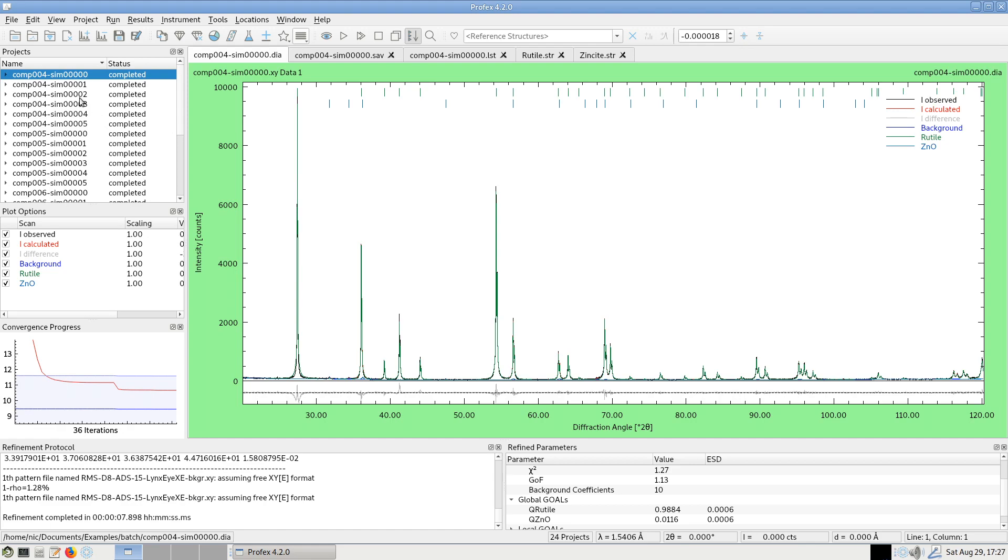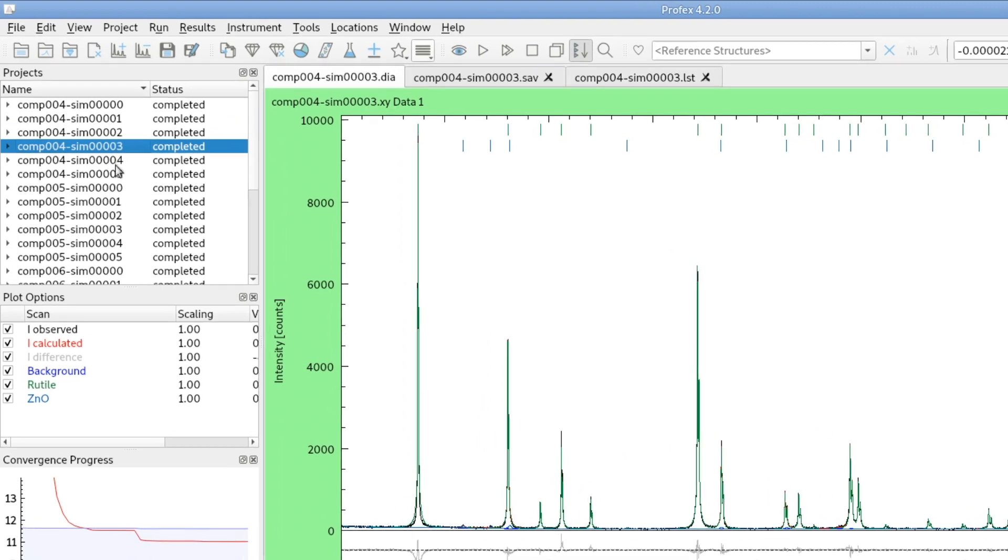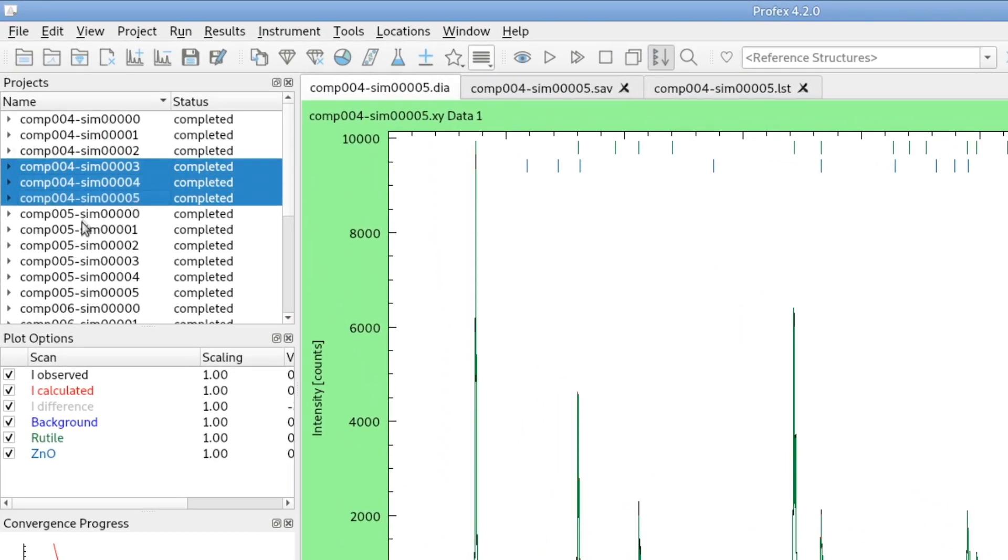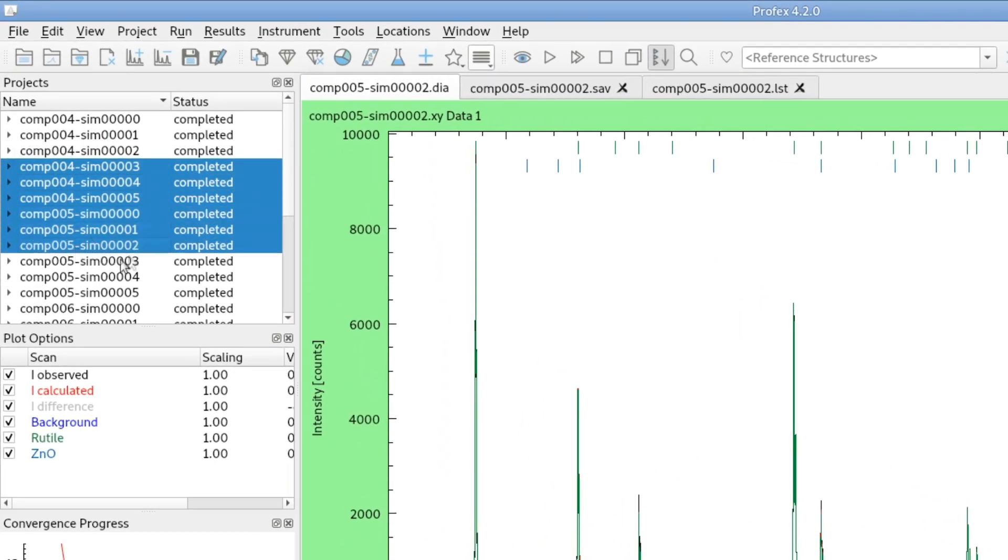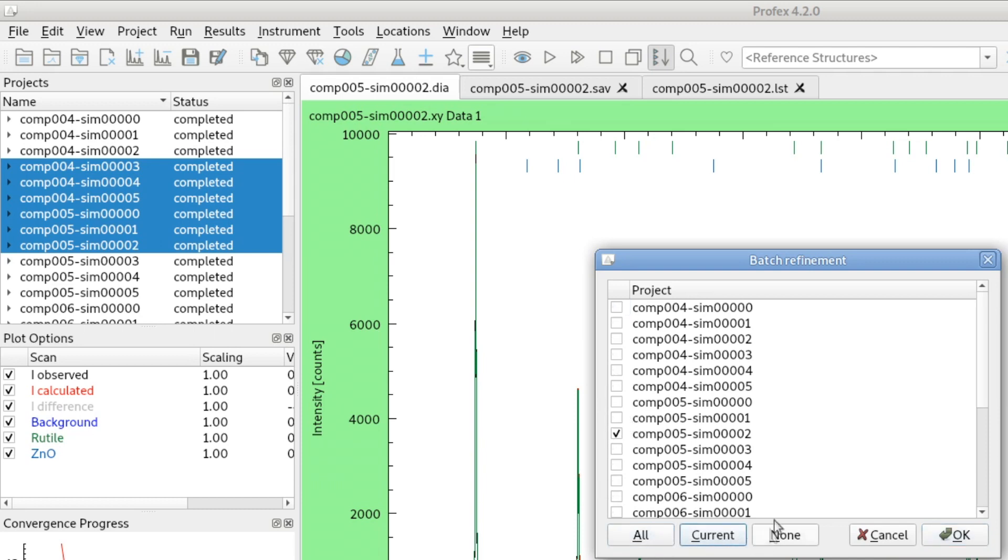First of all, we can select multiple projects in the projects list in the Profex main window. And if we have a selection and we start batch refinement, these files we selected will be pre-selected here. So that's another way of selecting the files we want to process. We can still use all the buttons here and do another selection. But anyway, sometimes it's easier to just select them here and they will be pre-selected and we can immediately click OK.